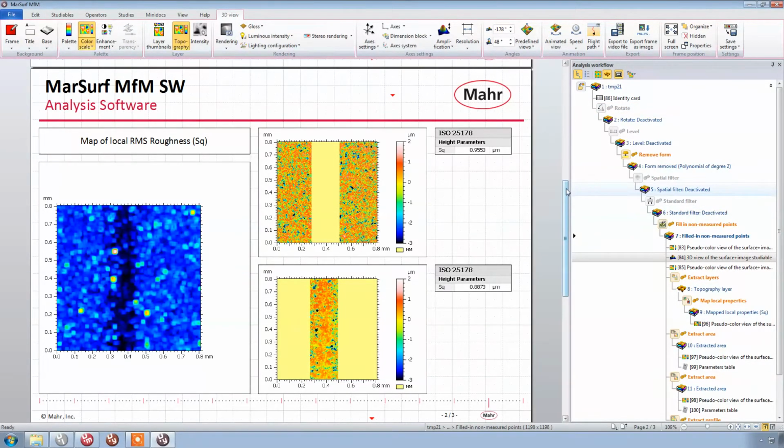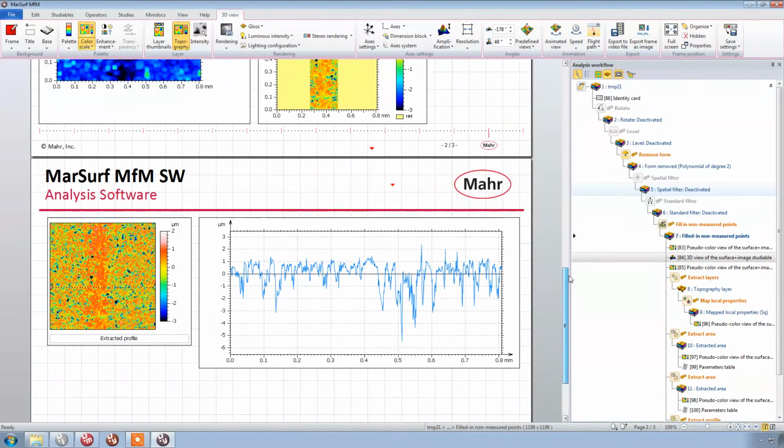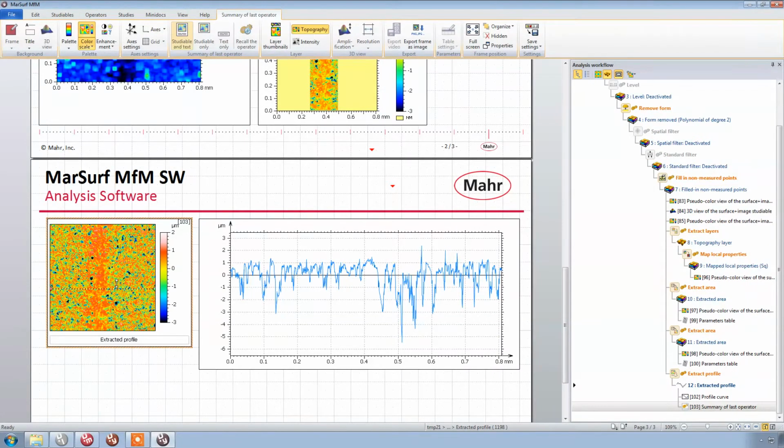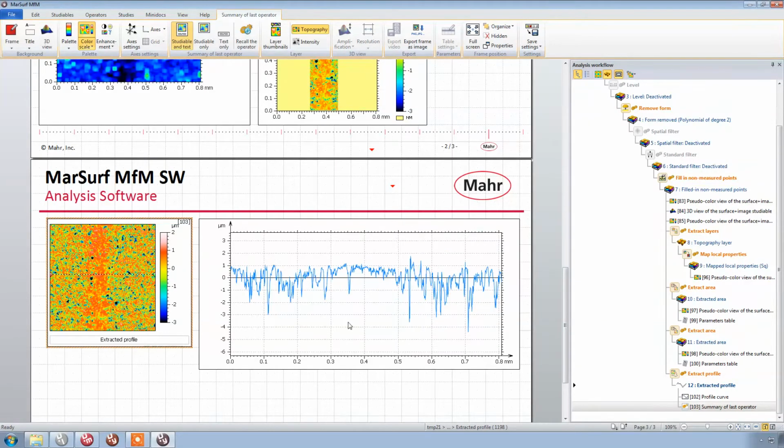If we were just to make a single trace and try to find a height difference where that pencil graphite is, we're just never going to see it. It's tough to tell, but I've got a left to right profile extraction here, and I'm just going to drag that around, and you can watch this update. We can look at this and say, oh yeah, there in the middle, there's something different. There's not quite as many valleys, it's filled in.